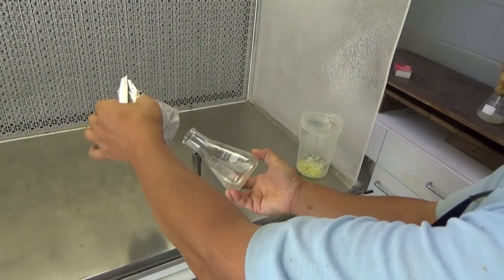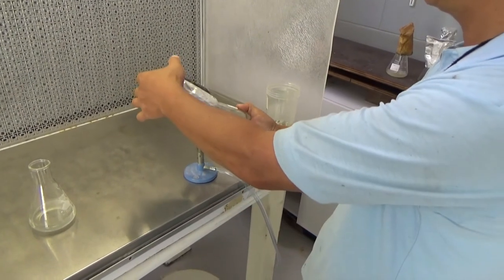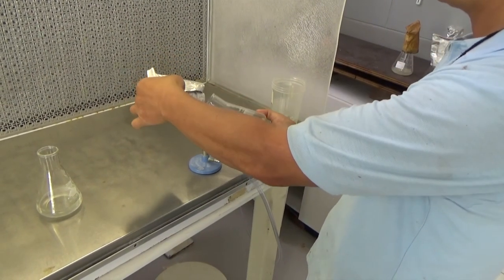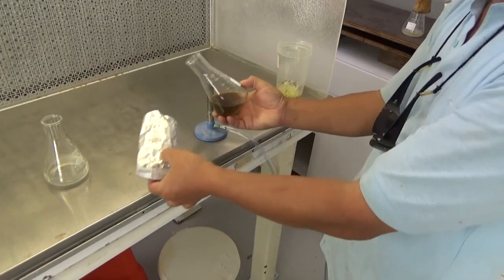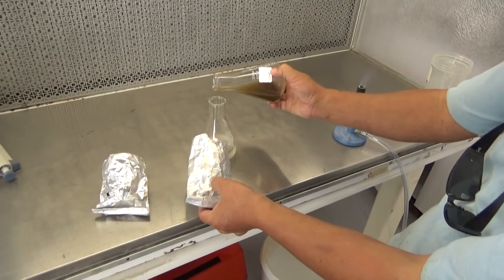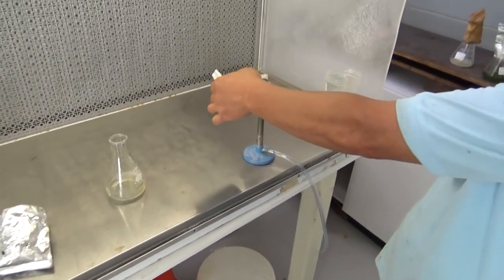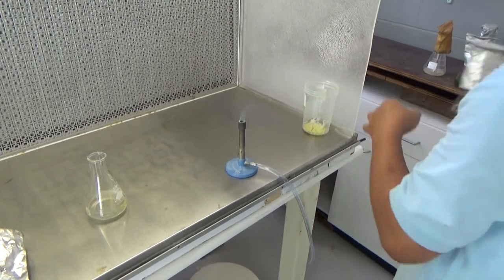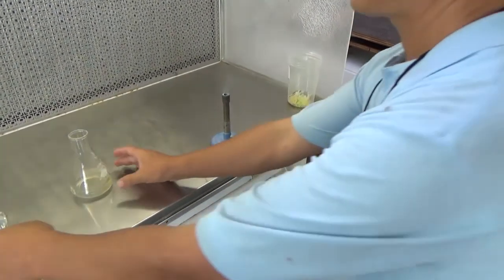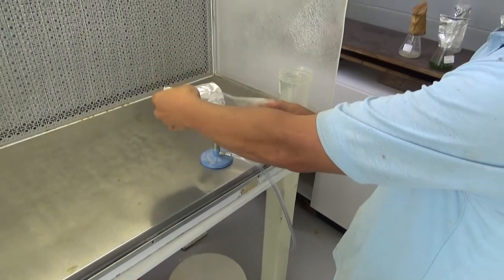Sterilize flask tops with a Bunsen burner flame prior to and just after transfer of algal media. And then we'll transfer just a little bit. Same. Go back on. This one. Same. Everything's open. Close.